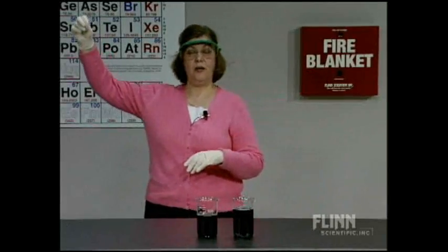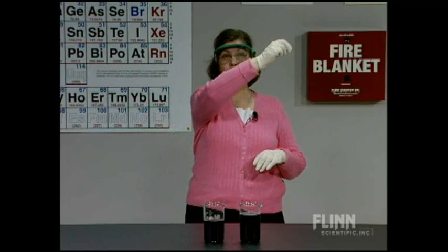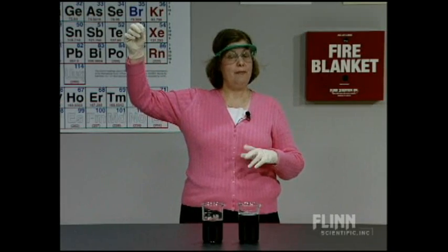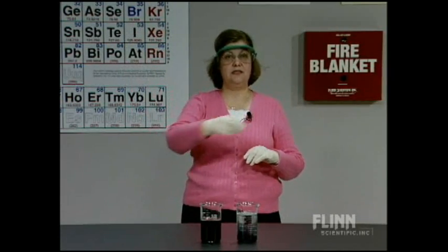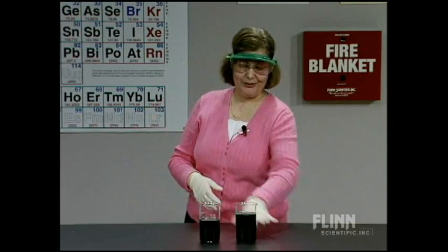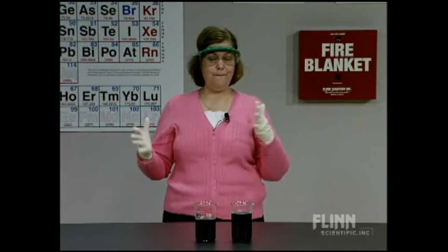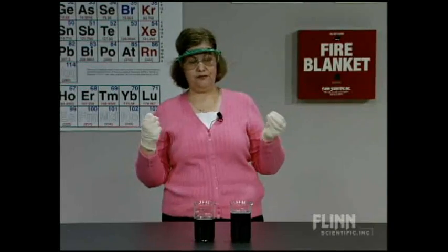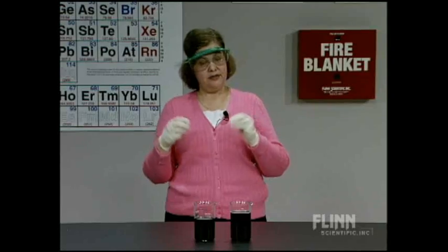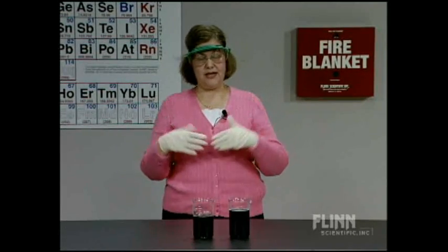So it's a pendulum. We have two pathways. It swings from one pathway to the next. And again, we're just talking about two alternate reaction mechanisms, ways for the reactants to be transformed. Very physical sense. You can really see this one bubbling now quite a bit. How long will that go on? About 10 minutes or so, 10 to 15 minutes. It depends. The concentrations here do matter. You need to have the precise concentrations.